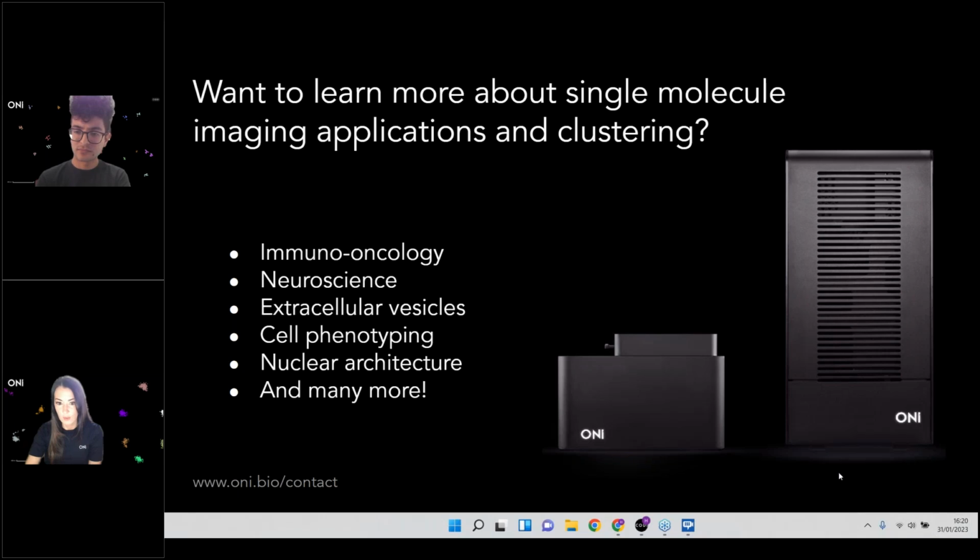All right, wonderful. The next question we have is, is there a specific order that one should follow when applying the constraints? Yeah, so this is a good question as well. Those constraints can be a new concept, and it might be a bit confusing how they work, but the way I'd approach it is to look at the first result from HDBSCAN, and then think about what it is about the clusters that you see that doesn't seem right. Now, you'll probably be able to describe that in words to another human being, but then look for the mathematical properties of the clusters that we've made available on the platform, and decide, does the idea that I have, like this cluster is not circular enough, or the cluster is too long and thin when I'm expecting something different, have some kind of interpretation or some metric which we can then apply constraints to? That's what you should be able to find on the platform.